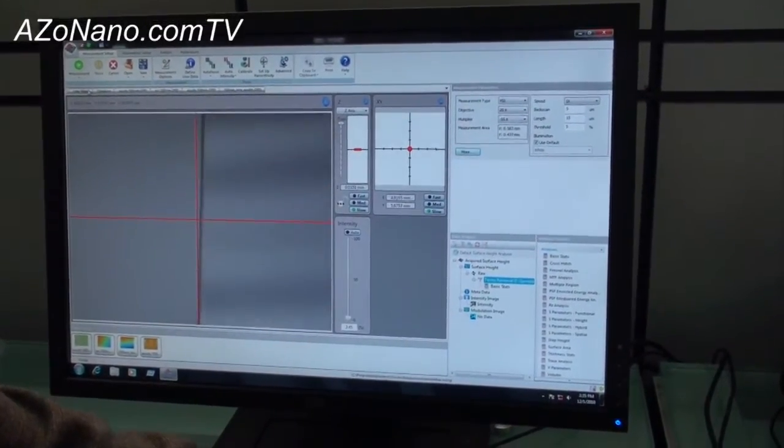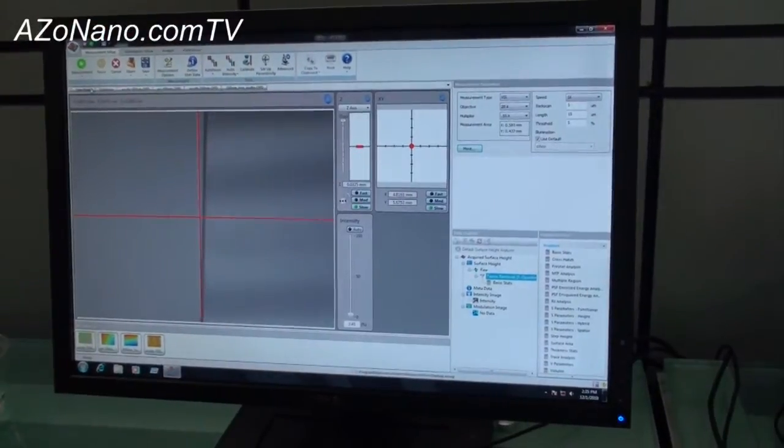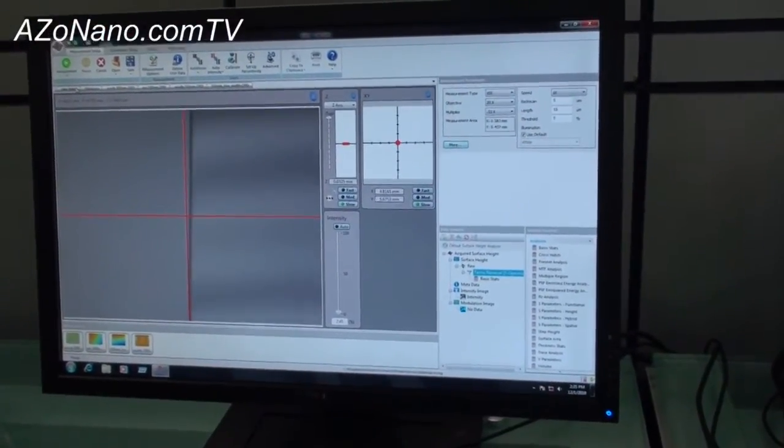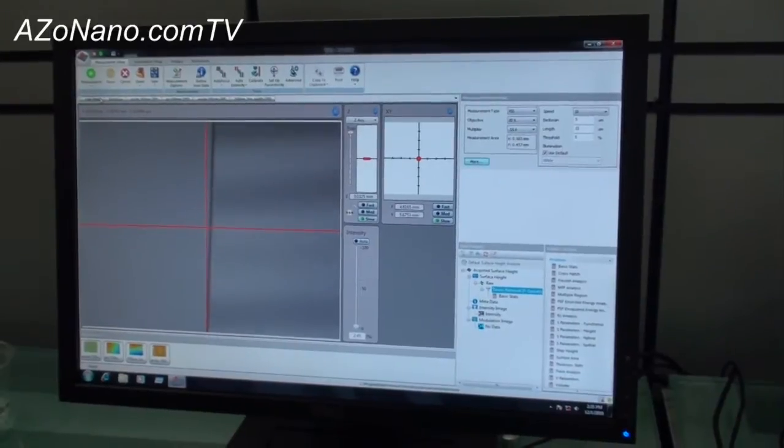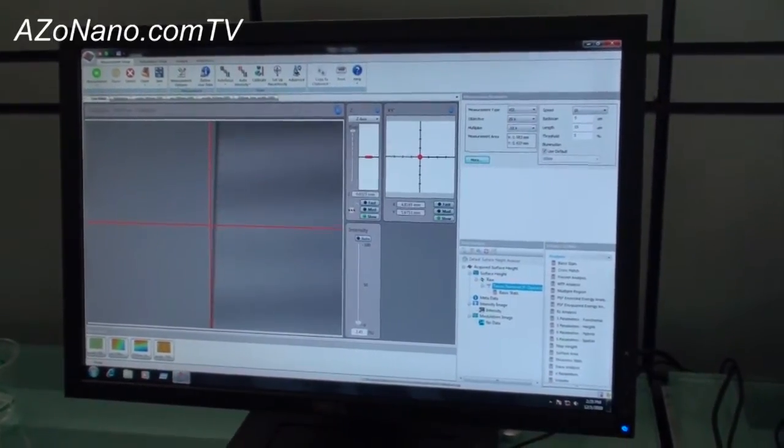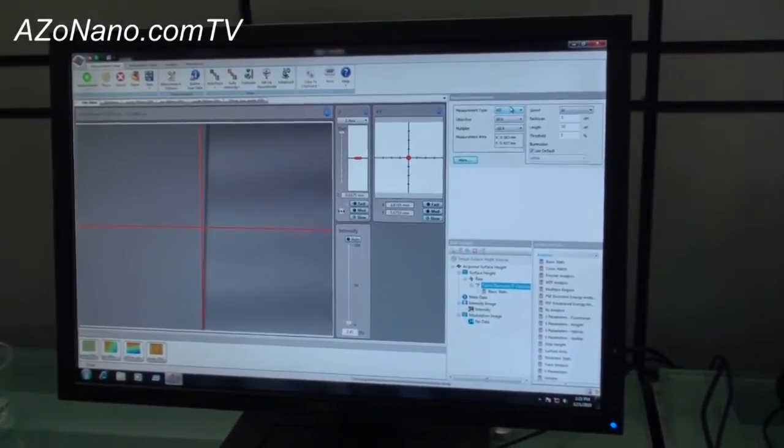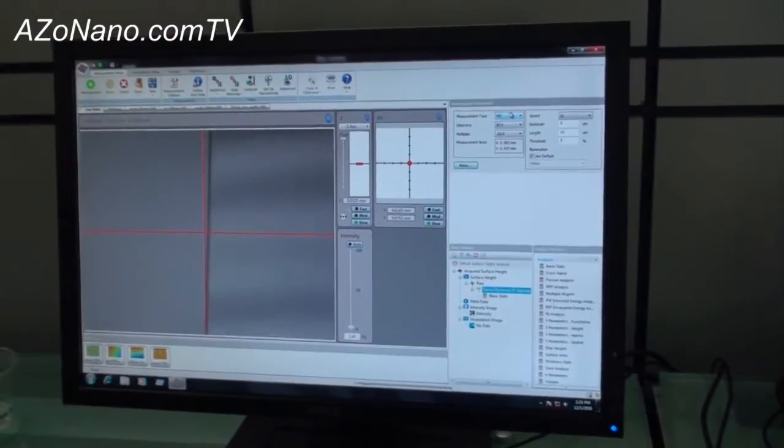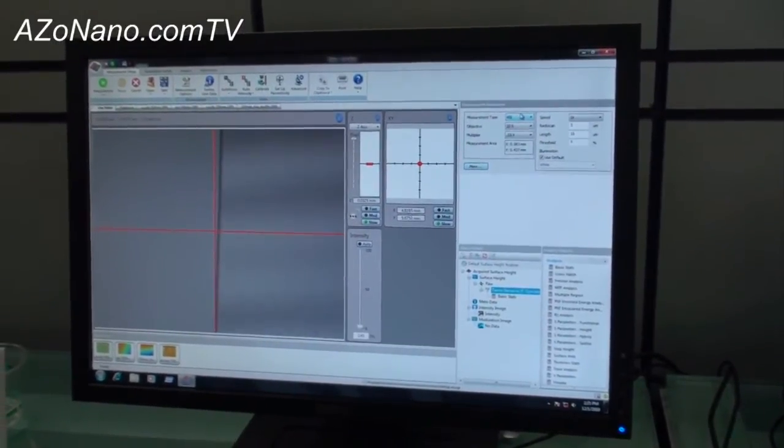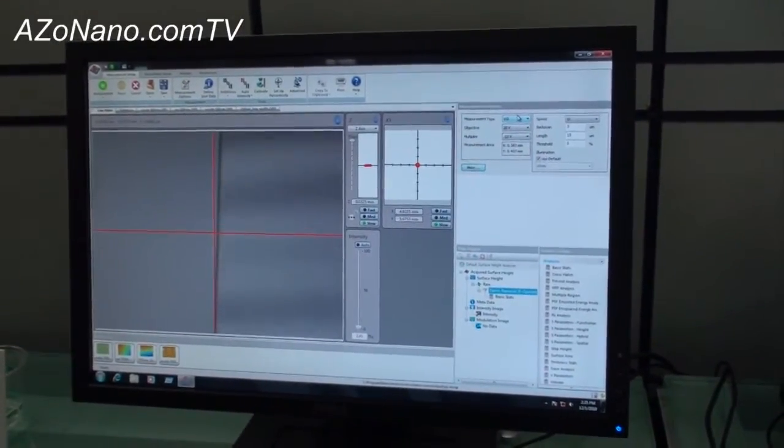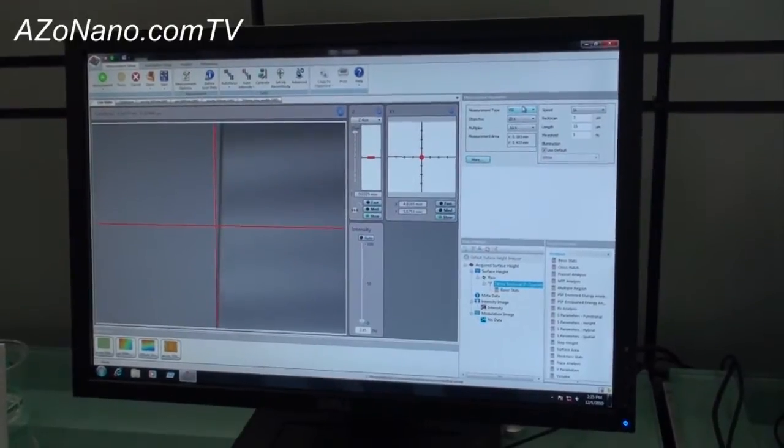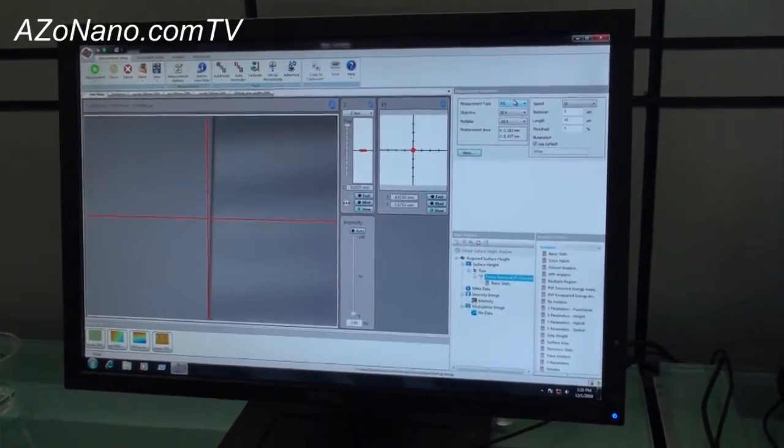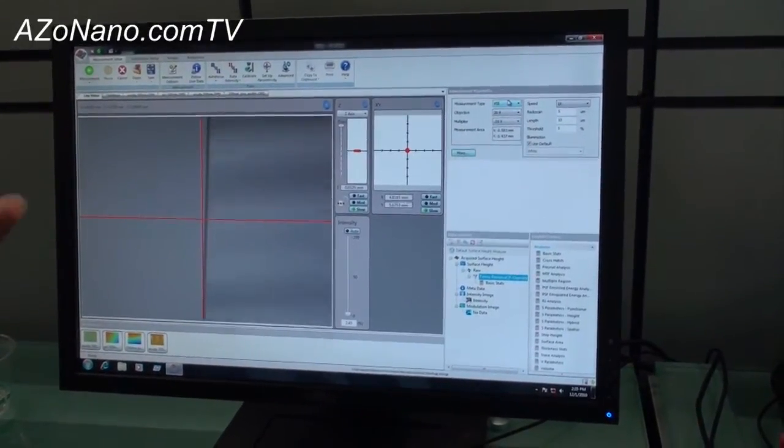And then what we're going to do is we're going to scan through focus. There's a couple different types of measurements. This measurement is of about an 8 micron size step. I'm going to use what we call vertical scanning interferometry. VSI is for large surfaces, 150 nanometers and higher all the way up to 10 millimeters we can measure. This has a vertical resolution of about 3 nanometers.